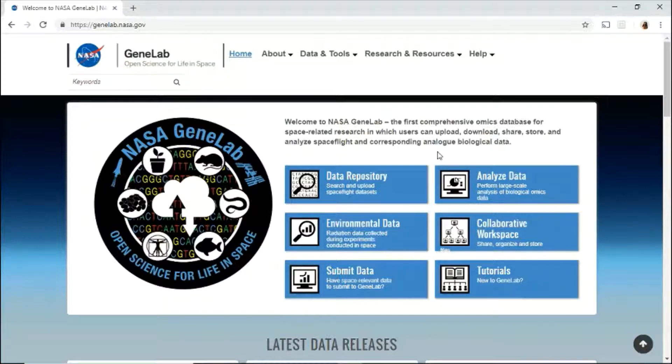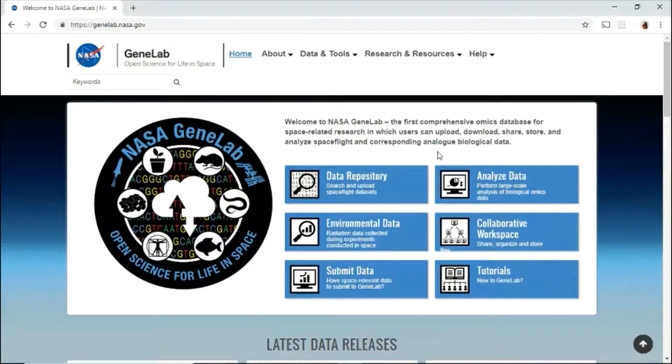In this video, we will present an overview of the GeneLab website, data, and available tools and how to navigate through each of them.